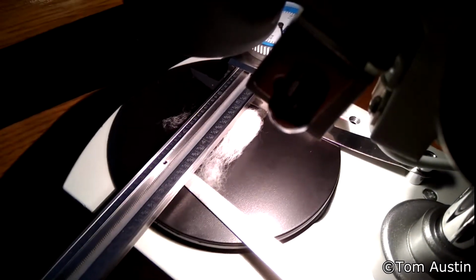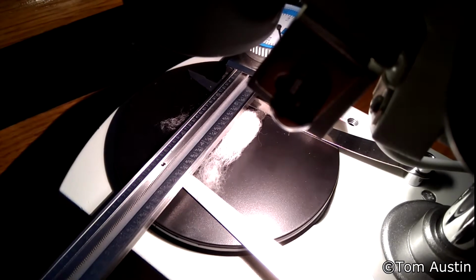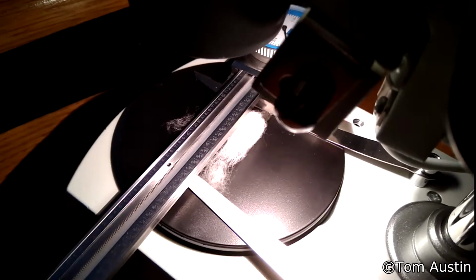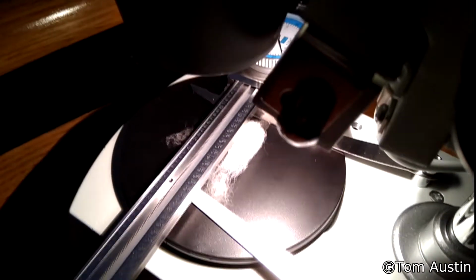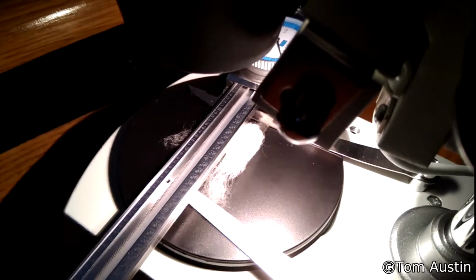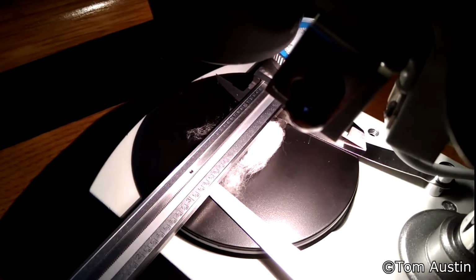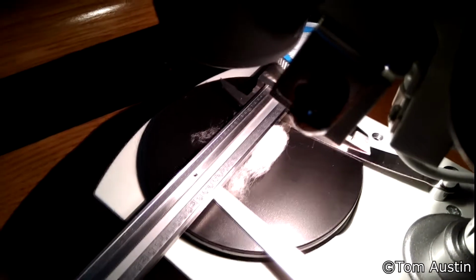It's not flattened out, but you can see how long the lint is. Back from the 5 all the way to that 5/8. It's definitely 1 3/16 on everything I measured and 1.5 on a couple of things. So we got a long road ahead of us. Maybe it won't be quite that bad in all the plants, but also, all the bolls I've picked are from 211. So this is all from one plant, and it just shows the variability in the crop on one plant just based off of environmental and genetic factors.